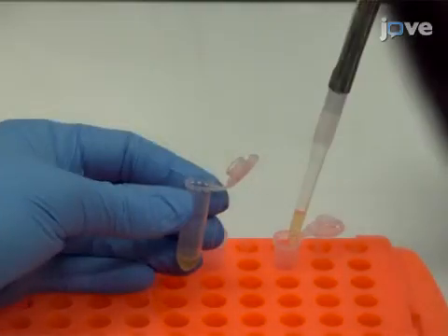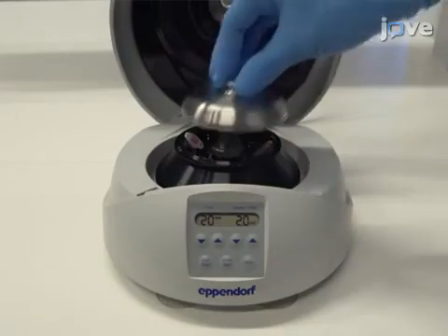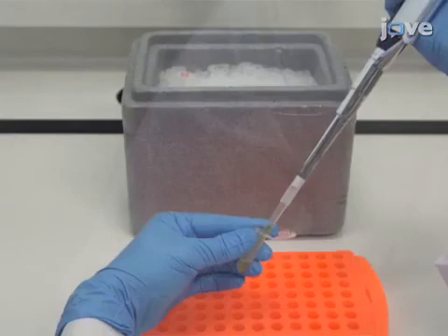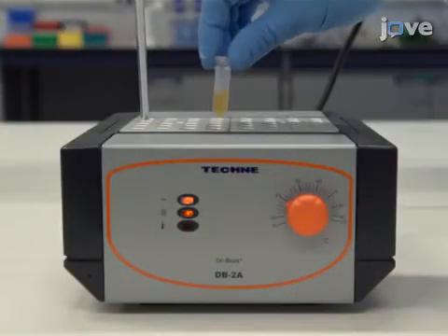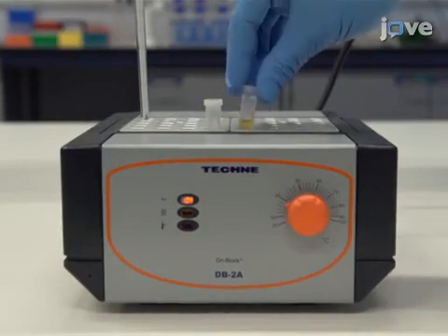Collect the supernatant and centrifuge the plasma again, now at 10,000 g for 20 minutes. Again, collect the plasma supernatant and add 10 microliters of RNase. Incubate the plasma at 37 degrees Celsius for 10 minutes in a thermoblock heater.